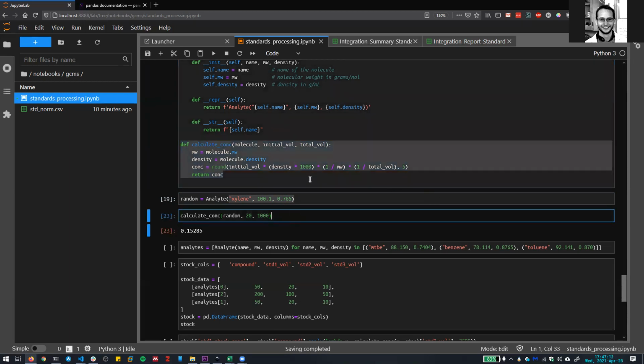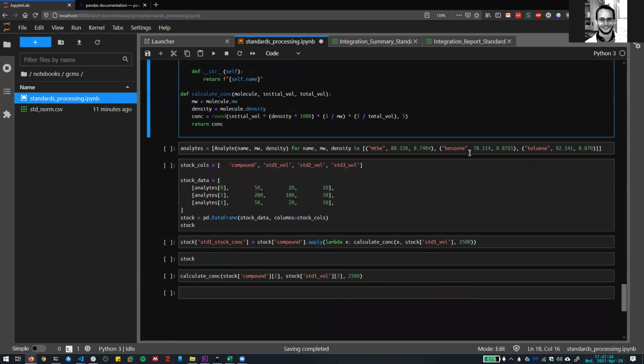Does that kind of make sense to everybody? I know this is a lot of Python stuff that maybe you guys haven't seen the syntax and stuff like this yet, but these things will come to you as you learn the basics. Anybody have any questions before we kind of move on? Okay. So I'm just going to delete these things because we're just playing around with them there.